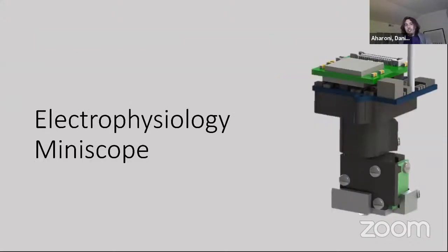We also are finishing up some work to integrate electrophysiology into Miniscopes. So we really like the coax cable. If you haven't said it enough, we really like having a thin cable coming off the animal. So whenever we want to add new features, like add a second LED for dual imaging, or add potentially some electrophysiology recording alongside the Miniscope, we really want to do this without adding any additional cabling. So the actual coax cable and the way it transmits data and power is quite flexible. So for all of our cases, we really designed the system to not add cabling and just pack additional data into the already existing cable.